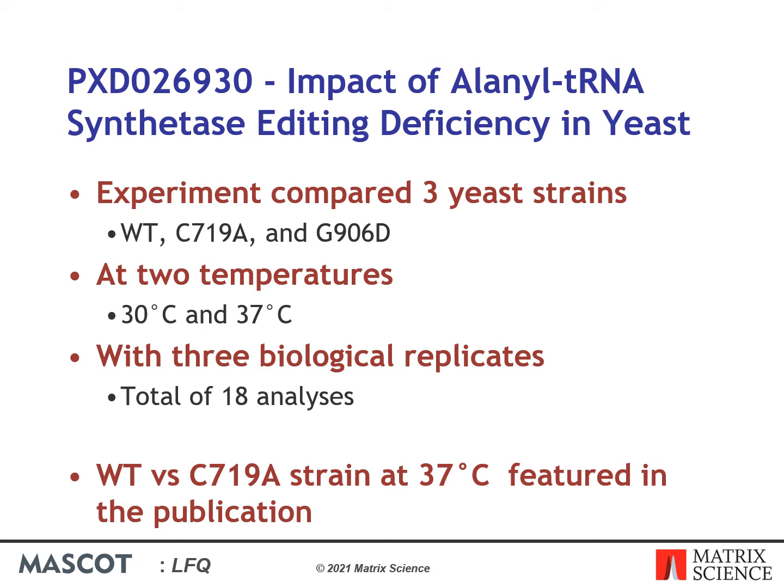wild type to the C719A mutant strain at 37 degrees Celsius, as this was featured in the publication. Note, at this point I created a replica quantitation method for the analysis on the Mascot server ready for searching and quantitation.